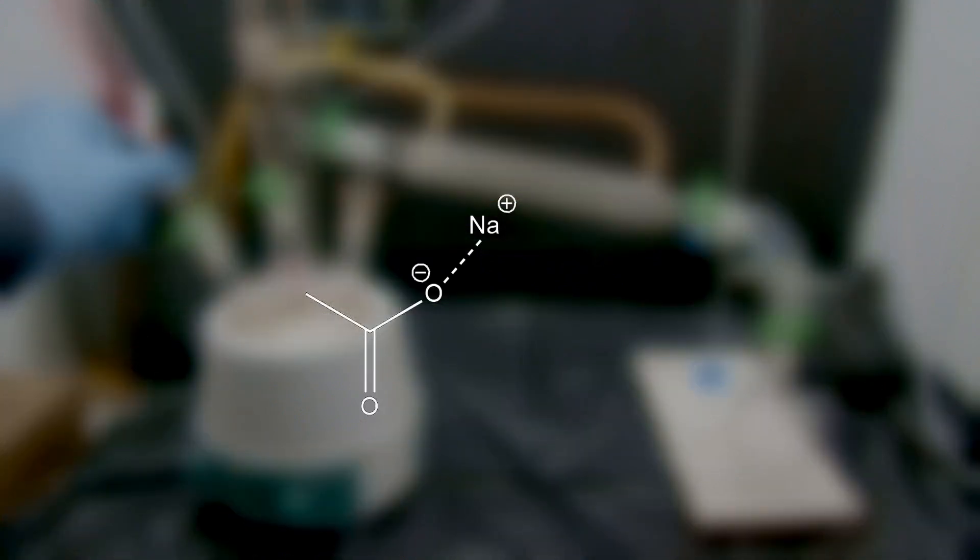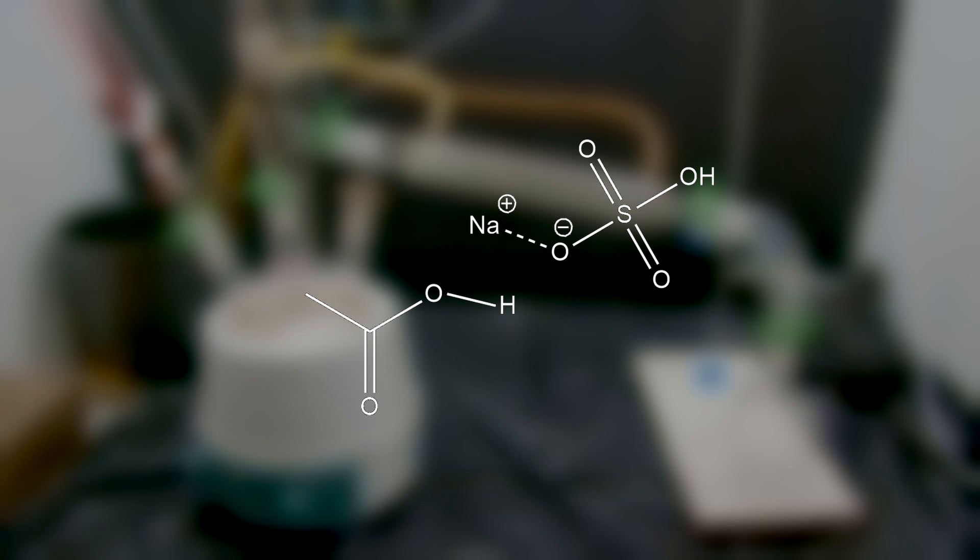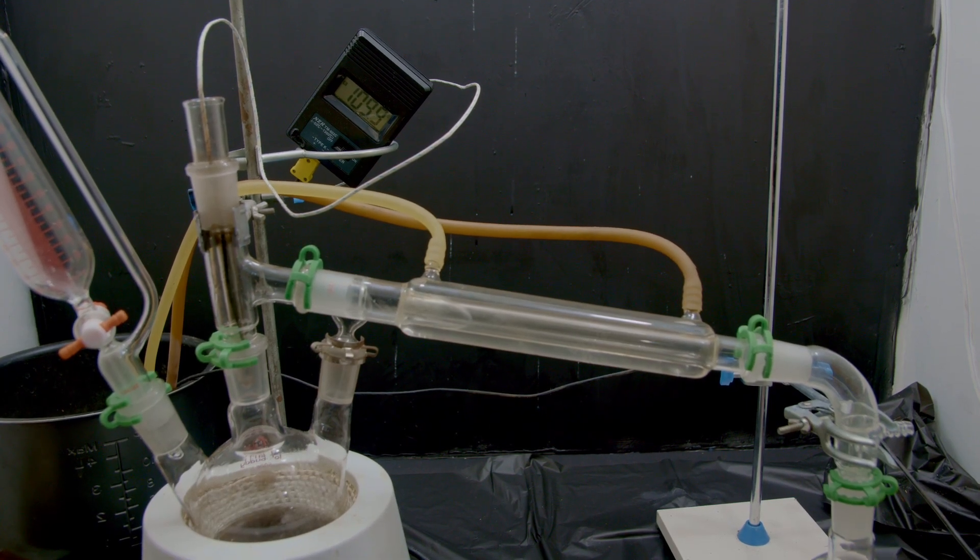So what's happening here is similar to what happened before, but this time the sulfuric acid is a more powerful acid so it trades the sodium acetate its hydrogen to give us back our acetic acid. Because this acetic acid has a really low boiling point, as it's formed we're boiling it off and collecting it on the other side.